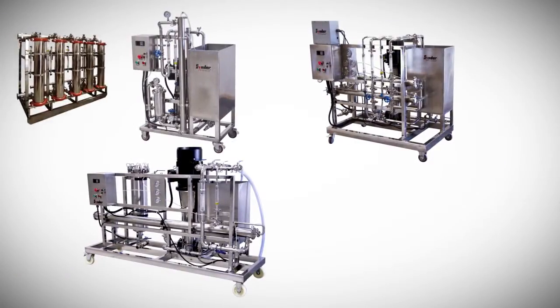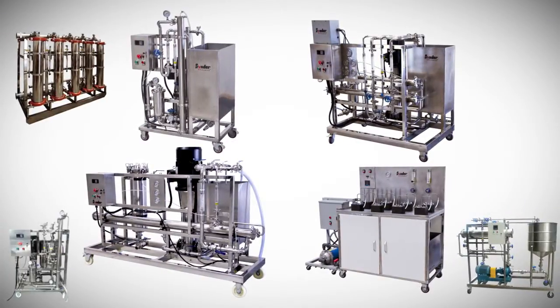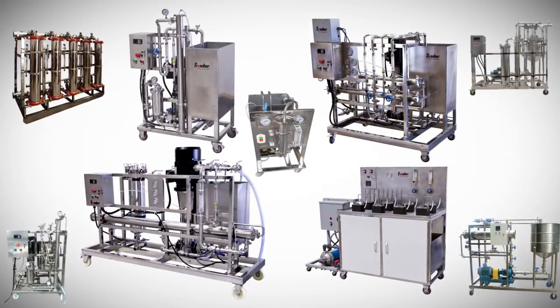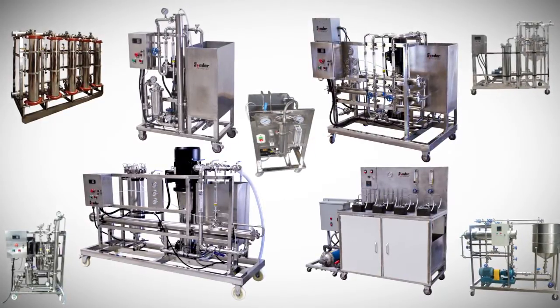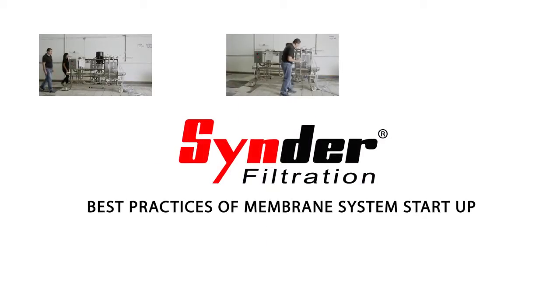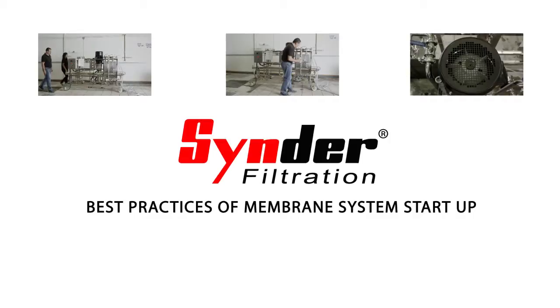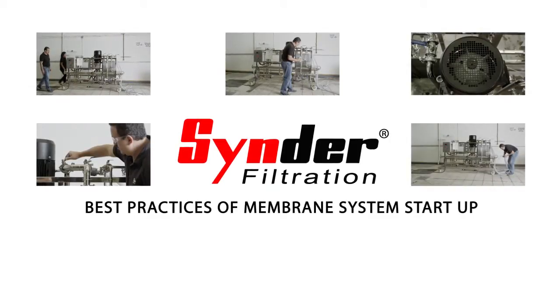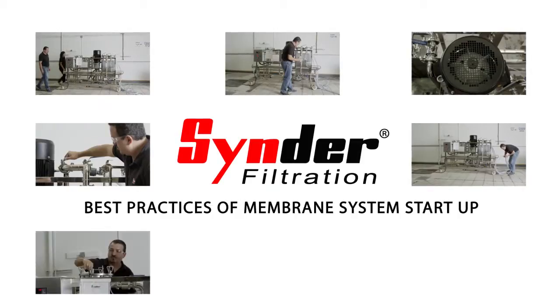Spiral membrane systems can vary greatly in design, controls, and complexity, but proper startup is essential to the successful operation of all systems. This tutorial video will demonstrate some important best practices during system startup of a manually operated system to help end users get the most out of their membrane equipment life and performance.